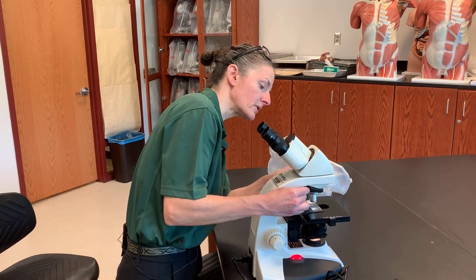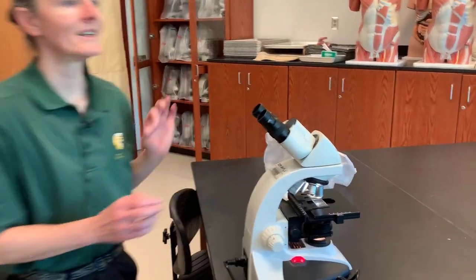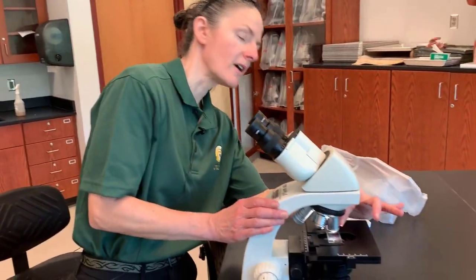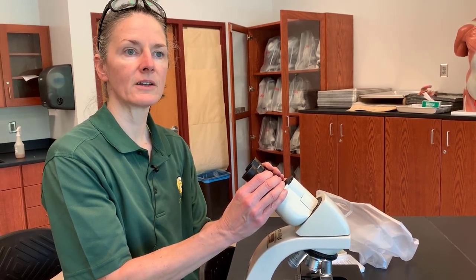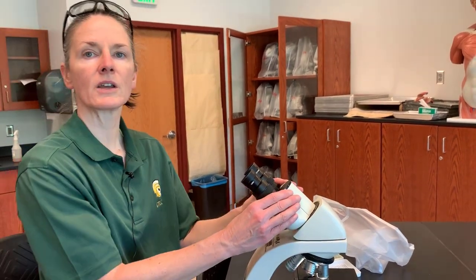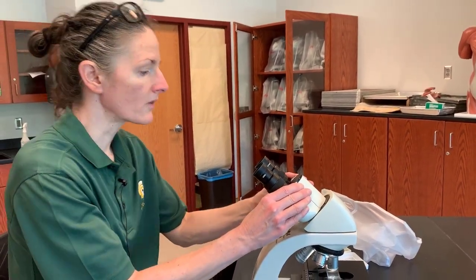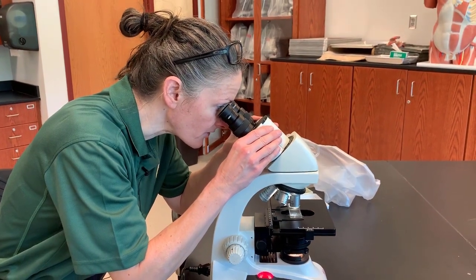We will move from the scanning objective to the low power objective. The low power has a 10x magnification, so we know that this will magnify what is on the slide 10x. Your ocular lenses will magnify it 10x. So to get the total magnification, you multiply the two to get 100x magnification — 100 times bigger than what it is under the naked eye.